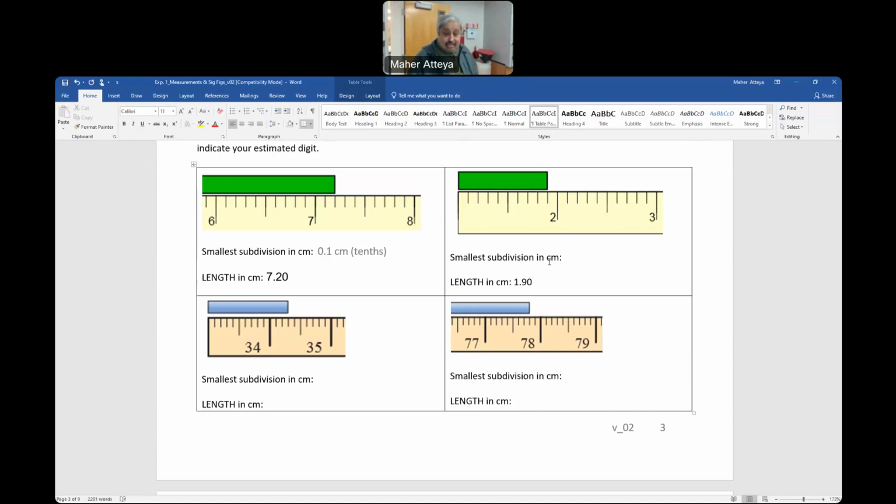Okay, so then you come here. What's the value here? 34 point what? 34.30. Again, the zero here is an issue, because then you have to look into this. I will go for that. That's my reading. Maybe somebody will read it a little differently, but the 34 we are agreeing is the correct answer. Then our issue is how to estimate in between. And the last one, how much is it?